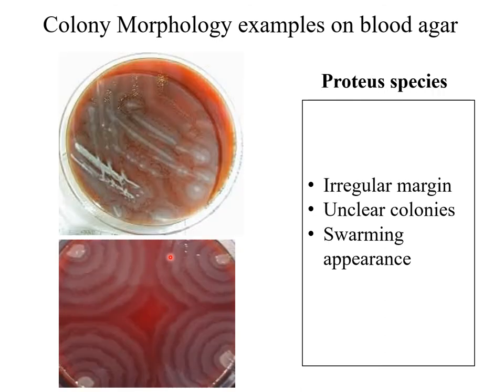Here we're looking at Proteus species. As mentioned, if you see this swarming appearance of the colony, think straight away of Proteus species. The colonies are irregular, have irregular margins, and are not clearly defined.